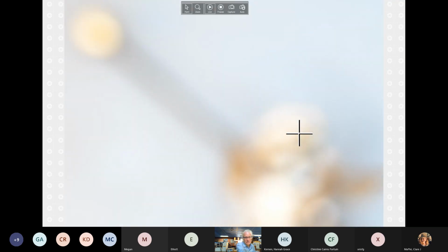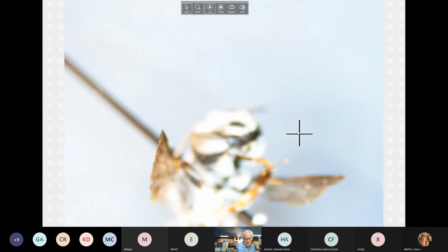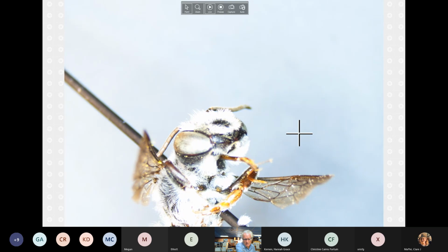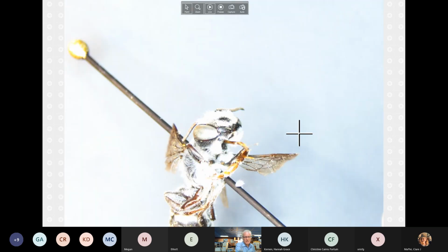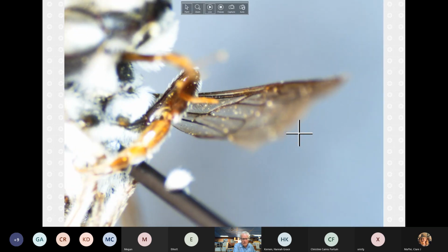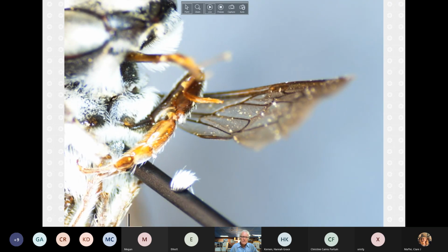Talking about guides, it's also useful for me to look at specimens and reconsider some of the things. So we're looking at Exilus. It's too dark right now, but if I bump up the magnification, make it more approachable. So here are the segments.